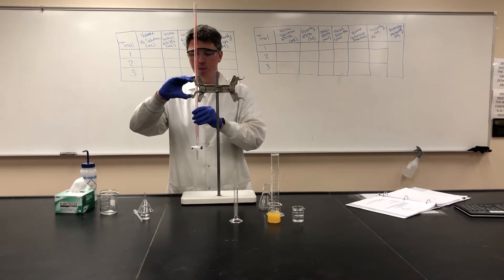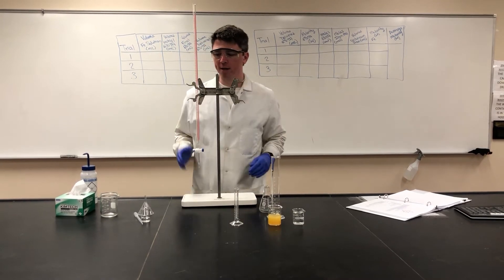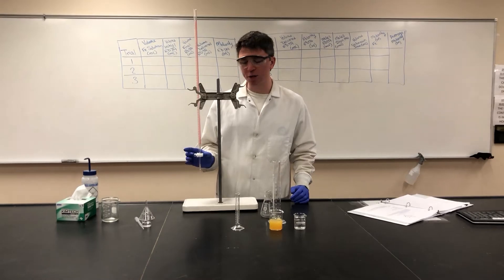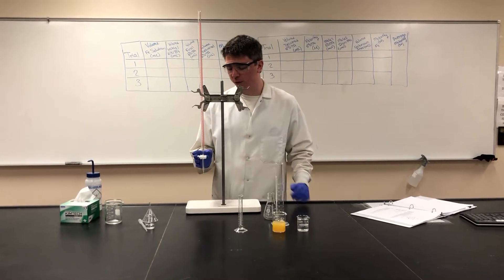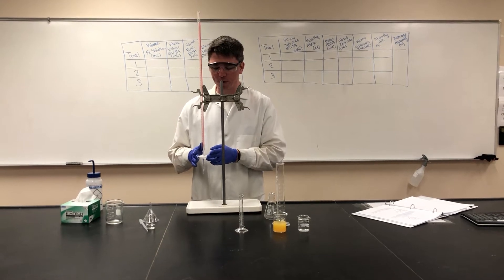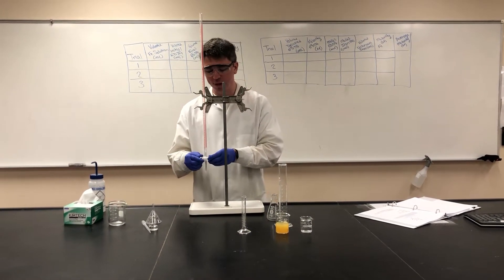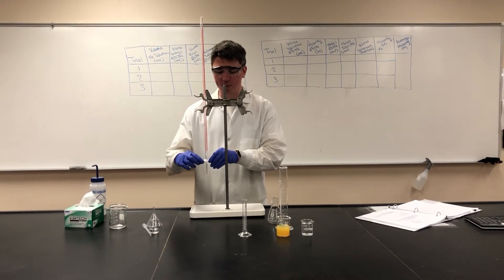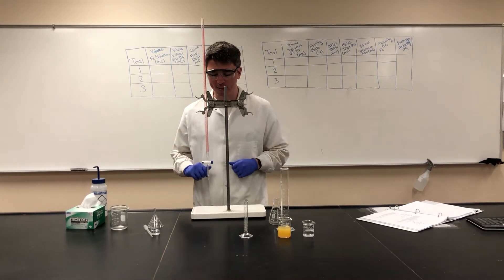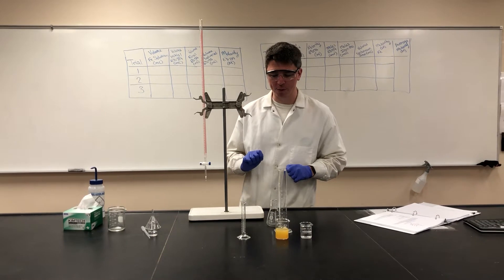If you have one with nice burette clamps, all you have to do is slide your burette in like that. The big thing to make sure is that your stopcock is closed. It will be closed when the plastic prongs are pointed the same direction as the table. There's a hole that runs through the stopcock in the same direction as the prongs, so if it is up it is open and liquid will drain through. If it's sideways, the hole is not facing up to let liquid drain through.